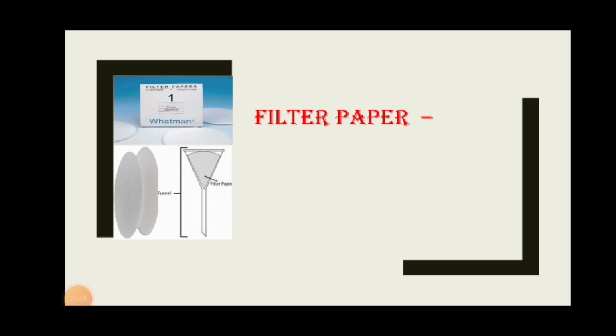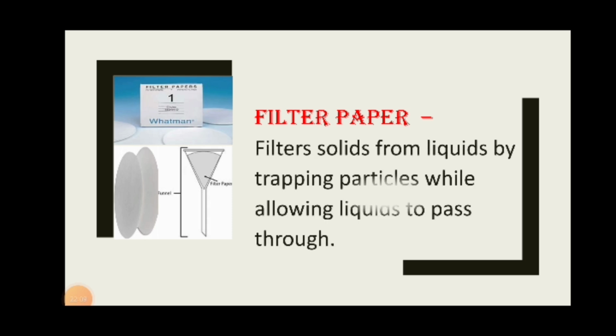And of course, yes, bilisan ko lang to, meron ka ring Whatman filter paper. Whatman is the brand of the filter paper, because if you want to filter something out of your experiment solution, you have to get only the solid particle separating away from those liquids. Yes, you have to use filter paper. Yes, Whatman, no, filter paper. The solid from liquids by trapping particles while allowing liquids to pass through.